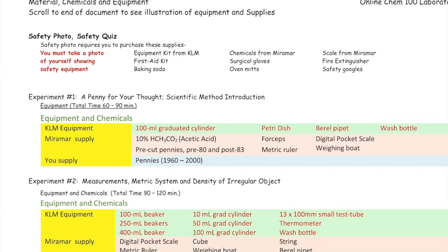Okay, so you'll see if you go from years, it'll start going down in terms of the mass. The newer penny will weigh less than the heavier pennies. Or do you think that the older pennies will be lighter because of wear and tear? So you guys are going to propose a hypothesis, and then you are going to do the experiment. You're going to take a range of pennies, weigh them out, and see whether one hypothesis is okay or not. That's the experiment, okay?